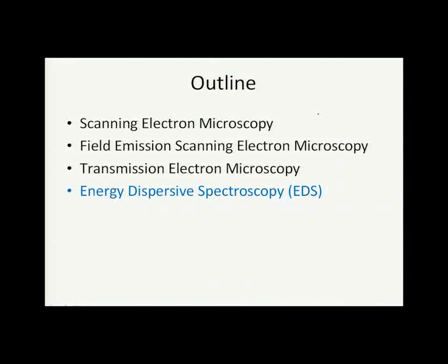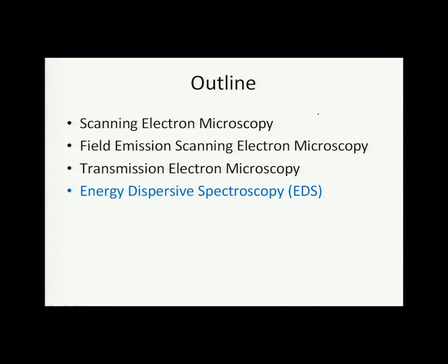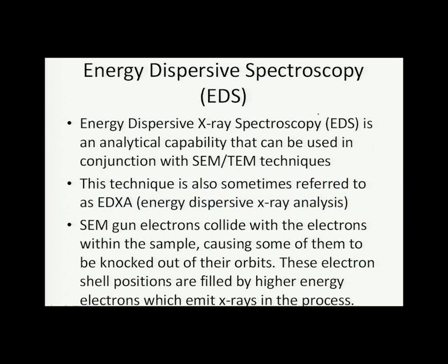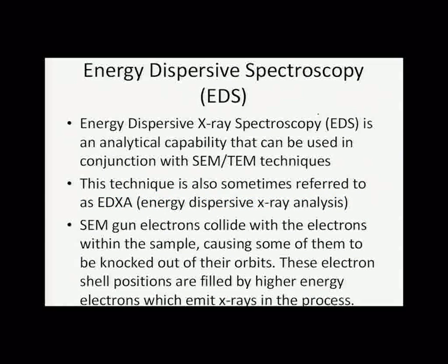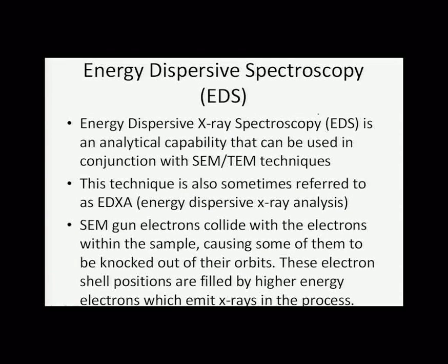So last up for discussion is energy dispersive spectroscopy, which we already kind of discussed, whether we knew it or not, when we were talking about X-ray emissions. So let's take a look at this. EDS, or energy dispersive spectroscopy. This is really X-ray spectroscopy. It's an analytical capability that can be used in conjunction with SEM or TEM techniques. This technique is also sometimes referred to as EDX or EDXA, energy dispersive X-ray analysis.